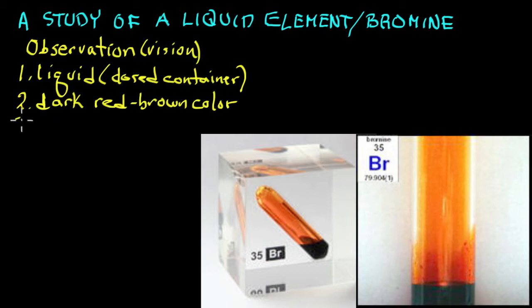And you'll notice there's, however you would describe it, like an elementary child, a light red-brown, you could call it fumes if you wish, a gas above it, vapor above the liquid. You can't do much more than that.